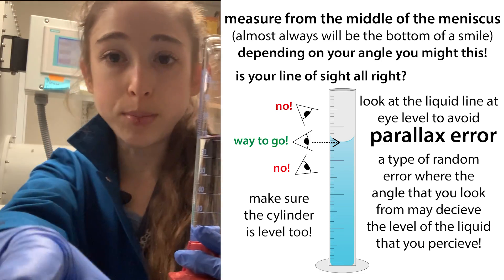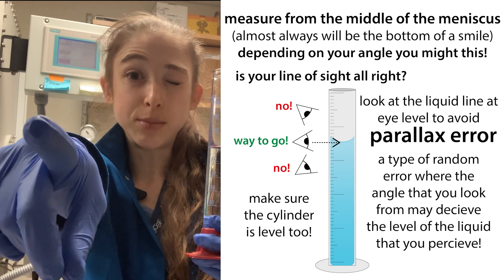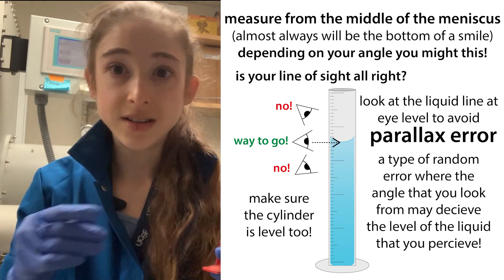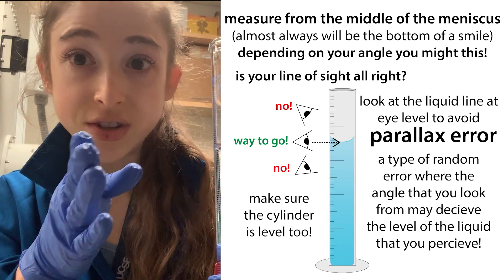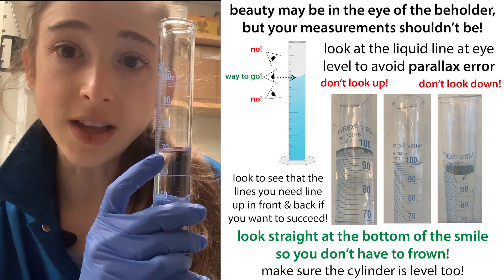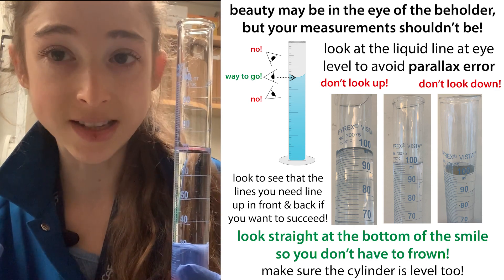To see what I mean, point your finger at some object, close one eye, then switch your eyes. The object in orientation to your finger moved, right? Similarly, the water level or the level of whatever liquid is going to move depending on the level of your eyes. And this introduces parallax error.